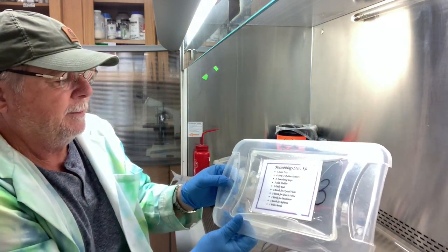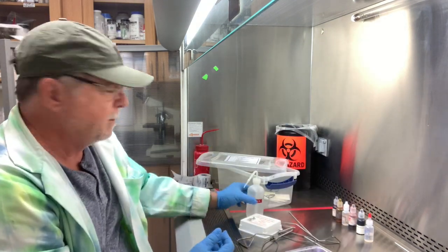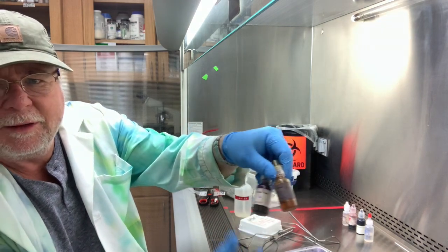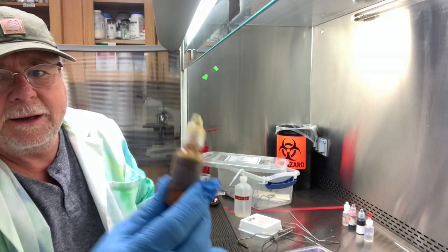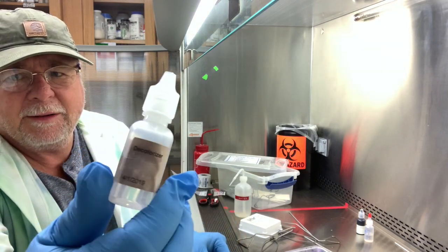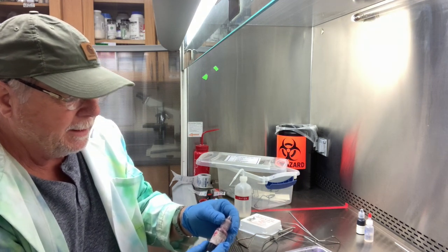And then we have some different stains and material, and a bottle of water. The squirt bottle of water is to rinse off the stains. We have 2 parts of a stain. This is crystal violet. This is iodine. And then we have a decolorizer, which is just an alcohol acetone mix to wash out things in the decolorizer or in the iodine step.